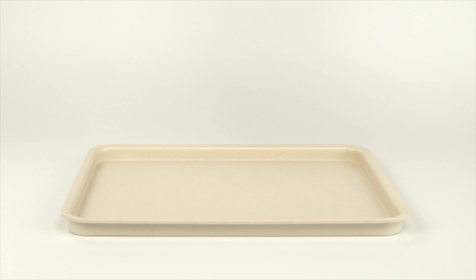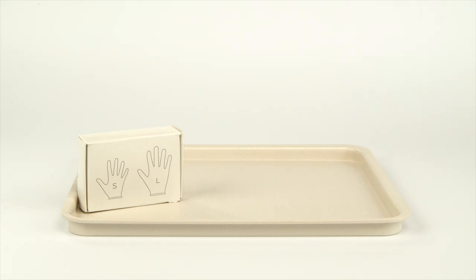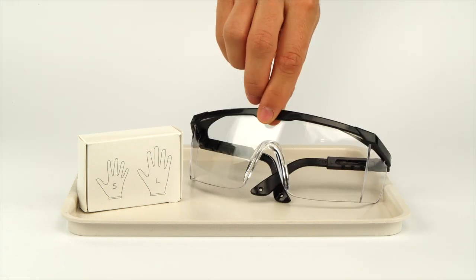Perform this experiment on the plastic tray to contain any possible spills. Don't forget to put on protective gloves and goggles before doing the experiment.